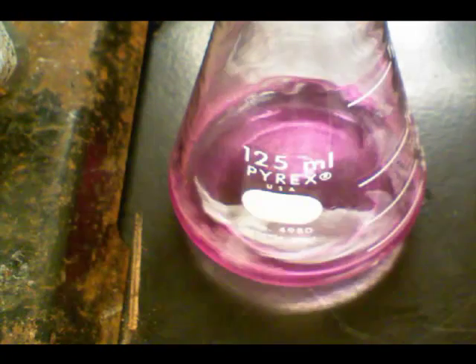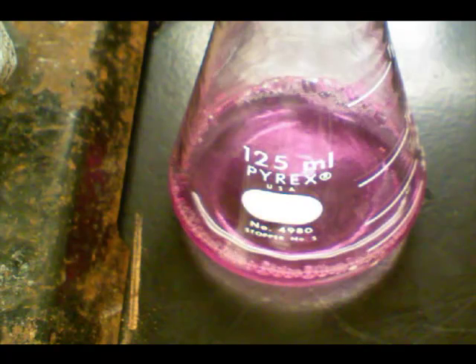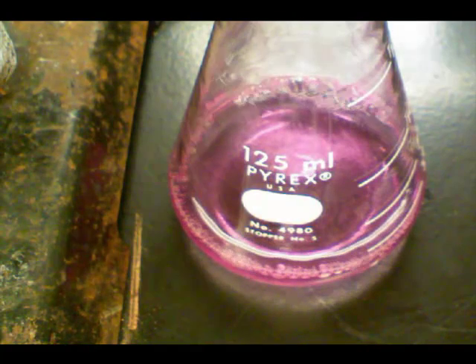Now it's not going to be easy to see this color change against that black lab bench, so I'm going to slip a piece of white paper underneath there to increase the contrast, and this will make it a lot easier to see when it changes from pink to colorless, because it'll happen fast. Okay, everything is ready, and now I can start draining acid into my flask.